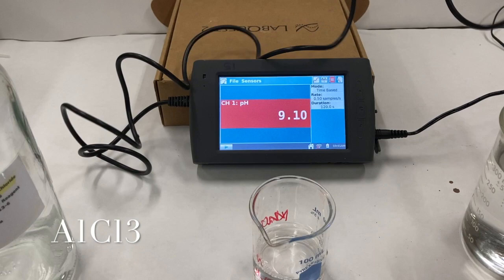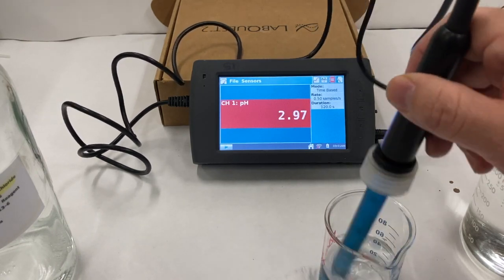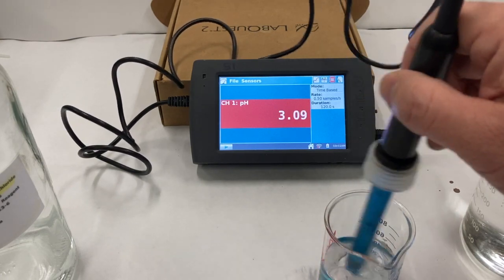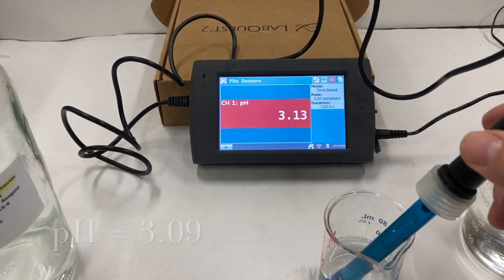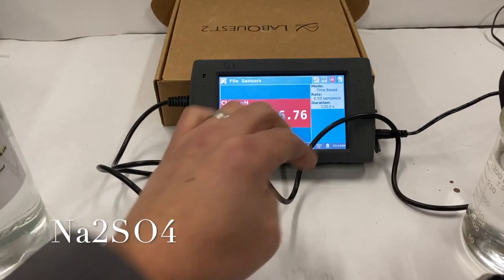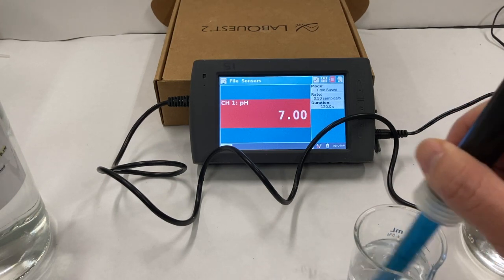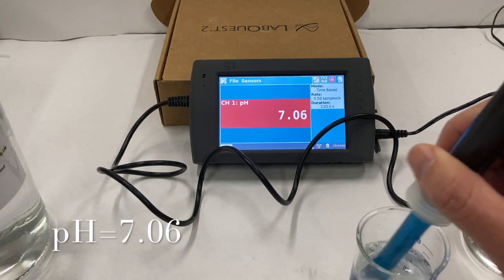Next up, we have aluminum chloride. Seems to like it here. We'll go ahead and call it 3.0. Too early. We'll just call it 3.09. Okay, so the next solution is sodium sulfate. I'm not quite sure. Let's go with 7.06.